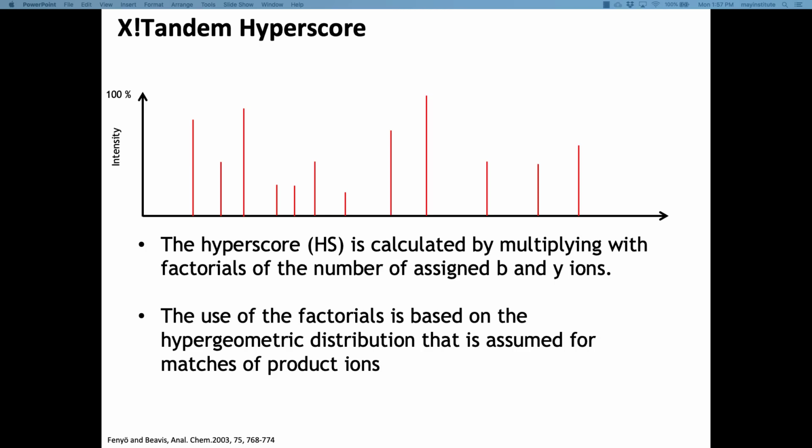Yeah. Low abundance, exactly. That's the main reason for crappy spectra. Because if you have only a very small number of ions that goes into the mass spec, then you will not see all possibilities of this fragmentation. So you end up with peaks or spectra that have low intensity peaks and a small number of peaks, and then of course the identification becomes harder, fundamentally because there's incomplete information in the experimental data. If you go to higher abundances, then you get cleaner ladders for most of these peptides, and that makes it easier to find them.